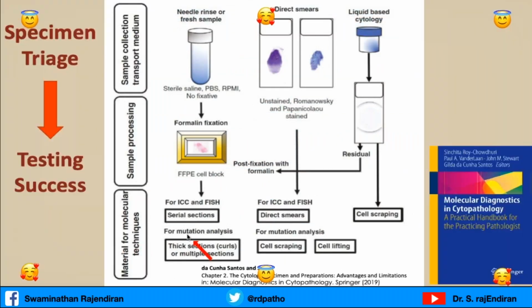So to test these markers, we have to carefully handle the tissue. If it is cytological tissue, make the cell block, with formalin fixation and paraffin embedded blocks, or use direct smears. After diagnosis, you scrape the cells and use cell scrapers. For liquid based preparation, cell scrapings you can use for ICC or FISH.